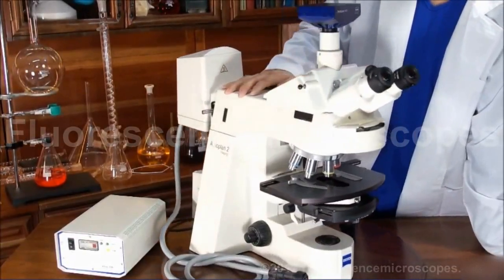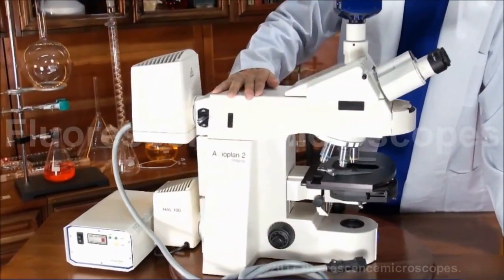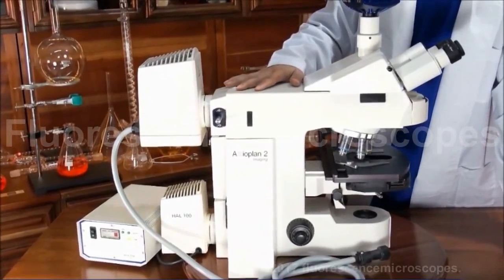If you have any questions about the Zeiss Axioplan II Imaging Microscope, please let us know. Thank you.